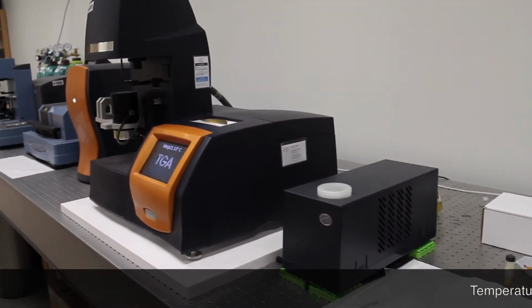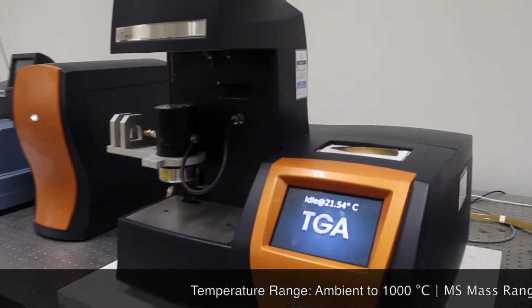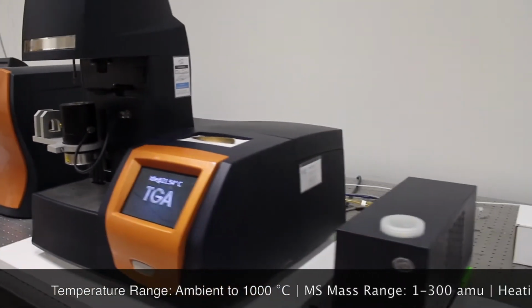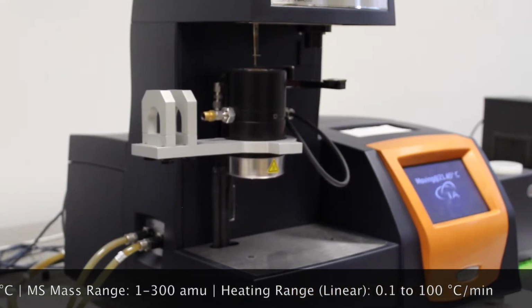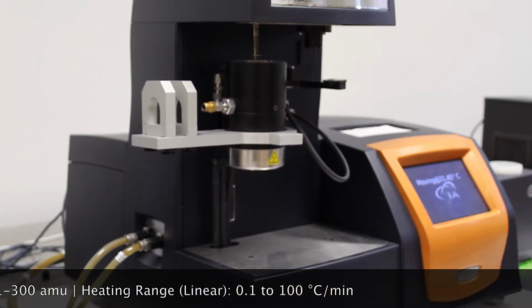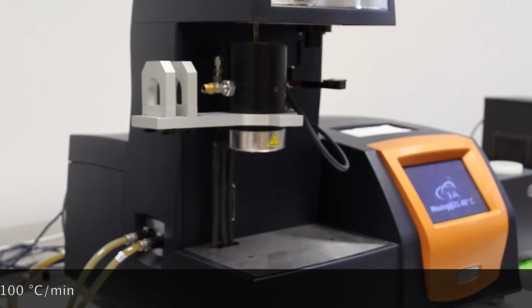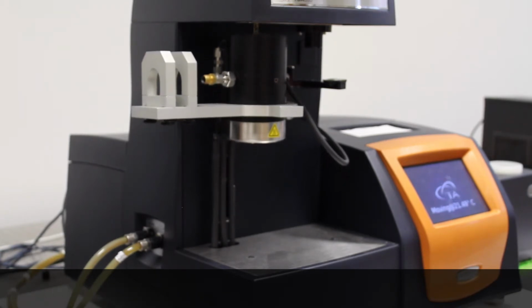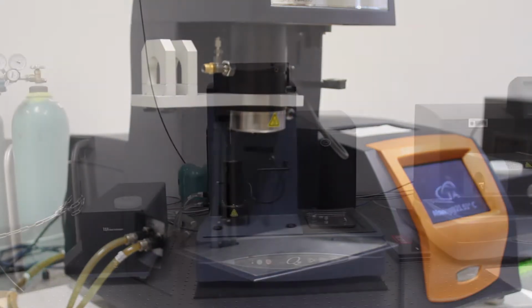The TGA 550 performs thermogravimetric analysis, which is a thermal weight change analysis measurement. The instrument is capable of high-resolution TGA, where the heating rate is controlled by the decomposition rate of the sample. Thermal decomposition of solid, liquid, and powder samples can be studied using this instrument. The attached quadrupole mass spectrometer can be used for evolved gas analysis simultaneously.